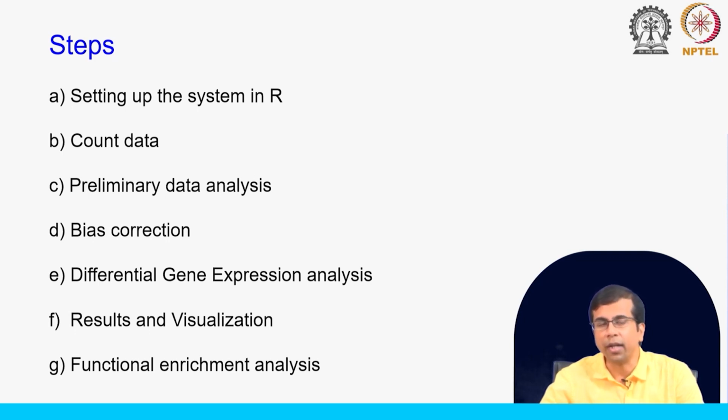Those we will do here hands on, and then finally, I will also talk about the functional enrichment analysis. There are different tools that you can use, but we will use one tool to actually do the enrichment analysis from our data set. So, this is the agenda. Let us start with the first part, which is setting up the system.